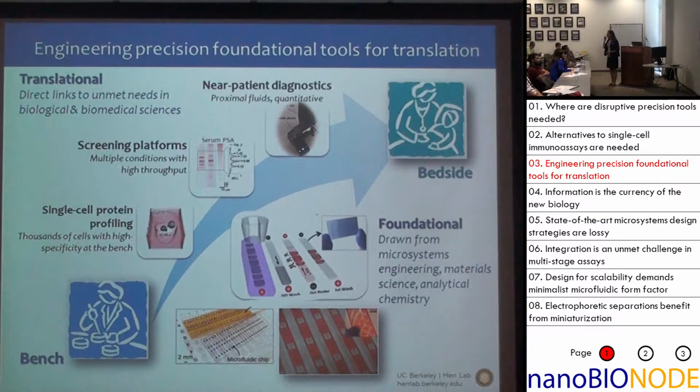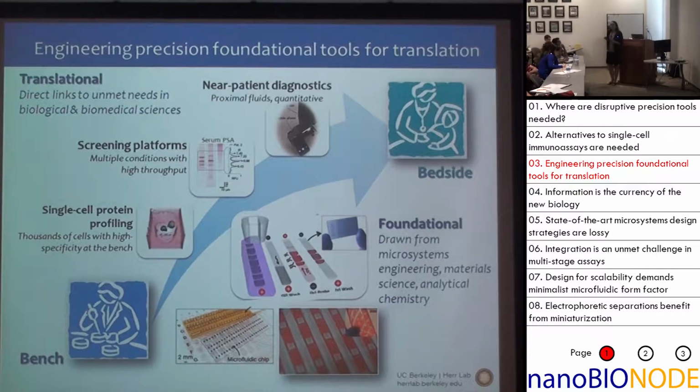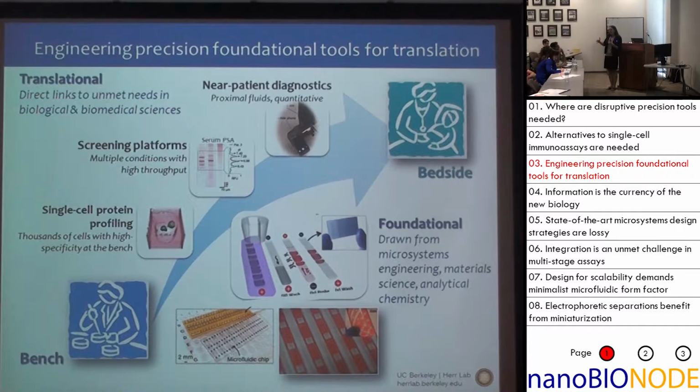And that's an area that we've worked on, mostly looking at what are called proximal or compartment fluids, so tear film fluid, oral fluids, cerebrospinal fluids, synovial fluids as well, all with an eye towards if we can make real-time protein measurements in compartments next to disease, so say synovial fluid with an autoimmune disease, for example, or arthritis, we might be able to tell how that patient is progressing and be able to modulate treatment based on response.